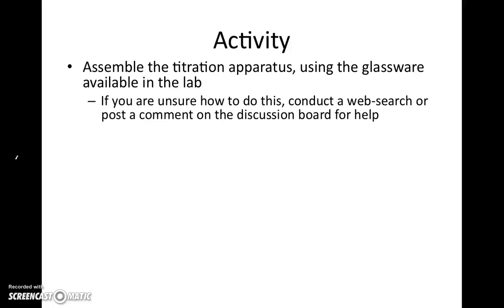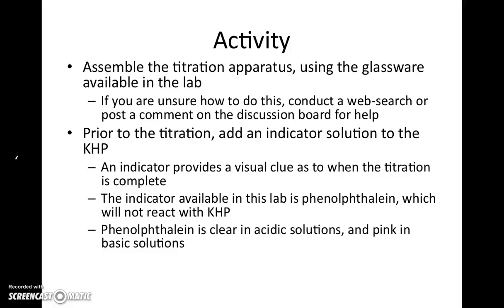Assemble a titration apparatus using the glassware that's available inside the simulation. If you don't know how to do that, then either do a web search, just looking for titration apparatus to get an idea of what pieces need to go where, or post a comment in the discussion board and I'll talk you through the process.